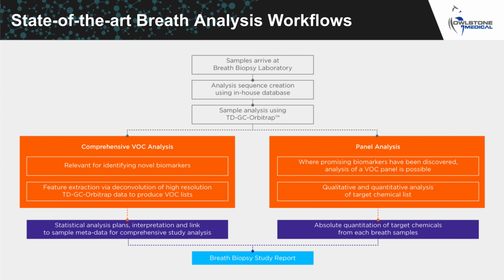One of the new additions is a dual analysis approach, which is to do a targeted analysis alongside our discovery or untargeted analysis. This is unlike our earlier workflow when we had to choose between one of the two approaches. So the initial parts of our workflow remain the same here. That is, samples arrive at the breath biopsy lab and we create a run sequence using our in-house samples database. But then we can run untargeted as well as a targeted analysis on the same sample at the same time.